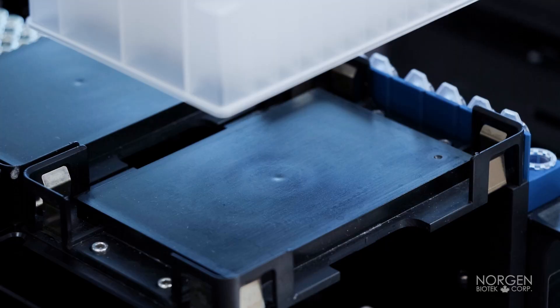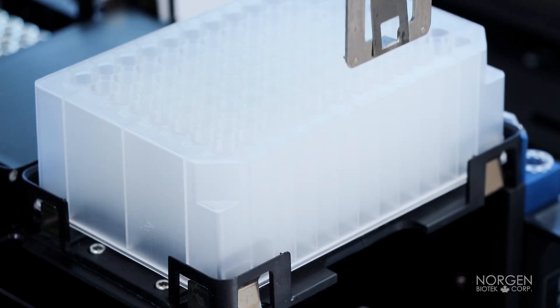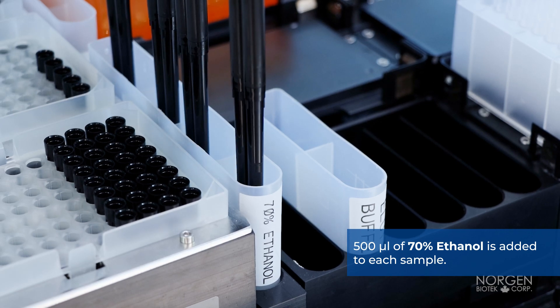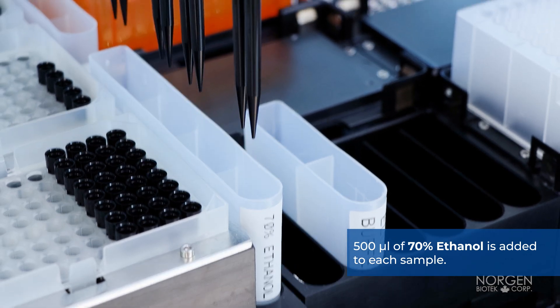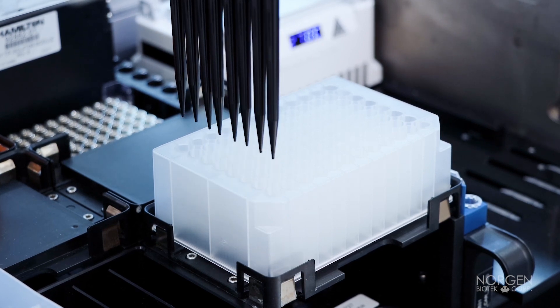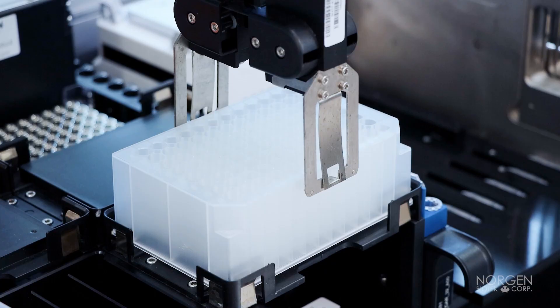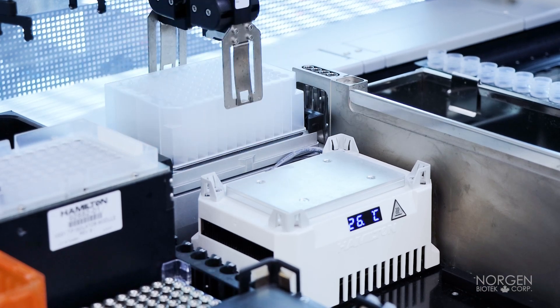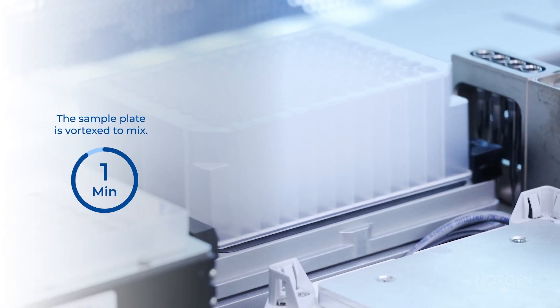The sample plate is then transferred back to the original position, and 500 microliters of 70% ethanol is added to each sample. The sample plate is transferred to the heater shaker and vortexed to mix for one minute.